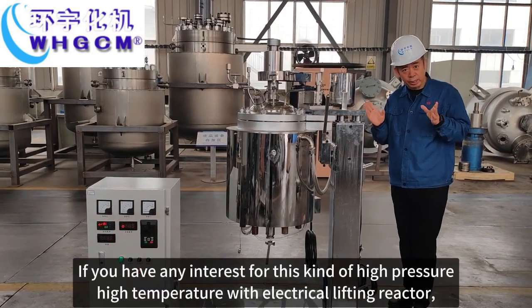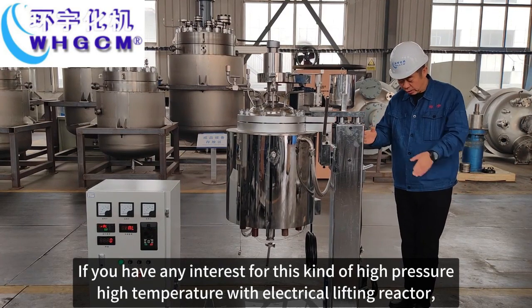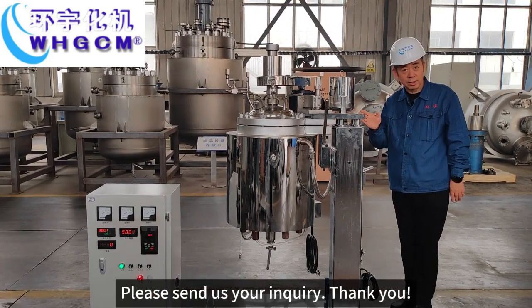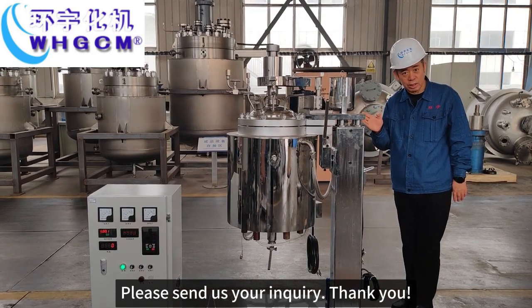If you have any interest in this kind of high pressure, high temperature reactor with electrical lifting, please send us your inquiry. Thank you.